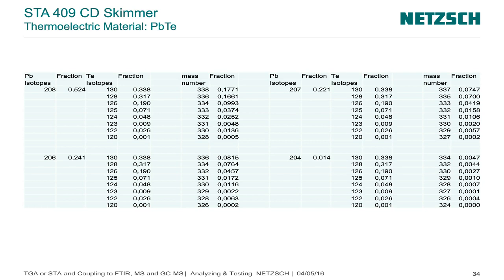The possibility is you add the mass number of lead and the mass number of the telluride, and then you get the mass number of your species. And if you want to think about the fraction, then you take the fraction of each isotope, make the multiplication to get the fraction of this molecule with this mass number. If you add all fractions together, then for sure you must have 1 or 100%, however you count it.